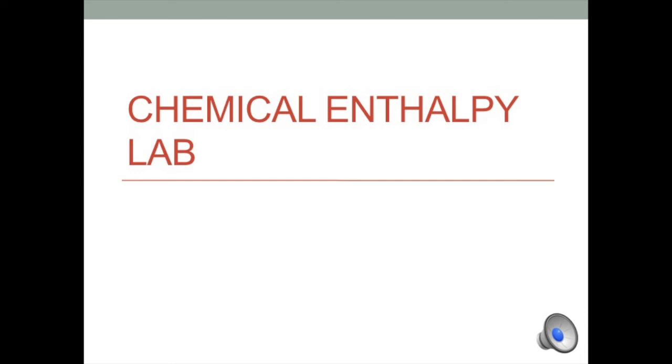Hello, everyone. So, we have been discussing all different components of thermochemistry, and tomorrow on Thursday, we are going to conduct a lab that just brings everything together that you all have learned and discovered up until now over chemical enthalpy. So, we're going to be discussing the different components that you're going to be looking for in the lab and experimenting with, and then in the end, calculating.